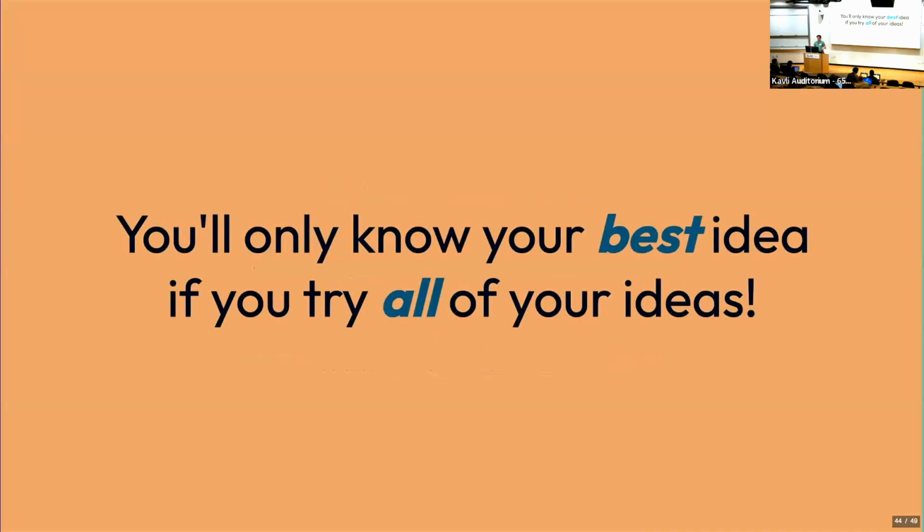because you'll slowly learn what just never works, right? A high filter resolution with force hard classification just never works. And eventually you'll just stop trying it. But you'll also learn, okay, sometimes this works and sometimes this works, so I always need to try both. And that's what I'm trying to show you with this story, that we have this discrete classification with very good poses in general, but in this case, the poses weren't quite good enough.